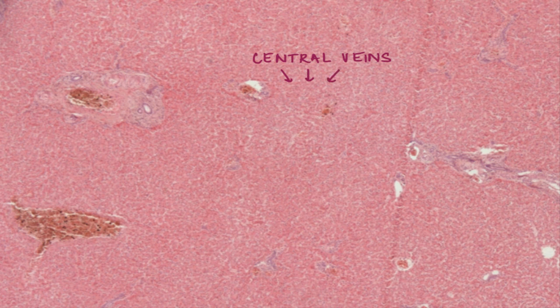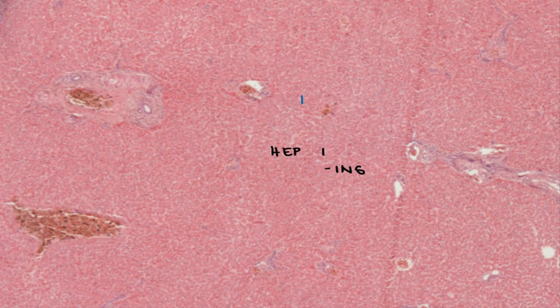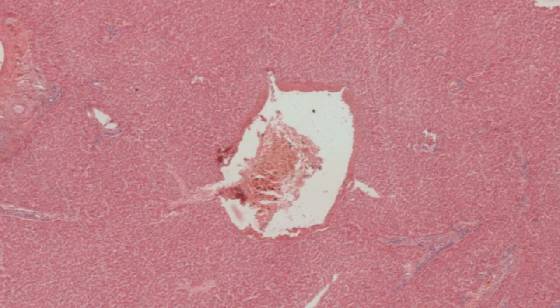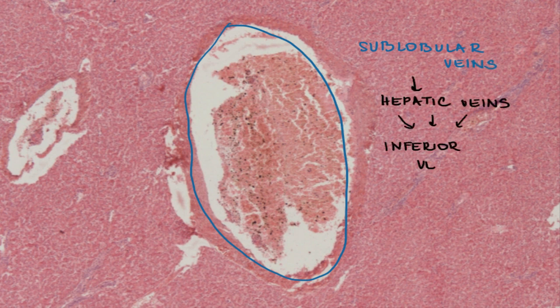Central veins join up and create sublobular veins, which drain into hepatic veins. We can see sublobular veins in this section and can also see that they are basically alone, not accompanied by any other structure. We can see a sublobular vein with its tributaries and a bigger sublobular vein. They join and create hepatic veins, which then enter the inferior vena cava.